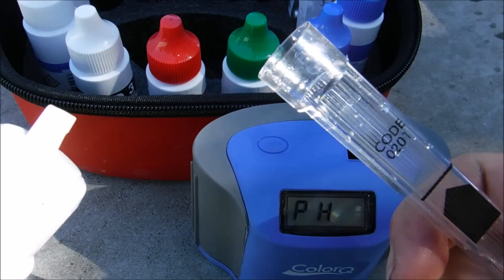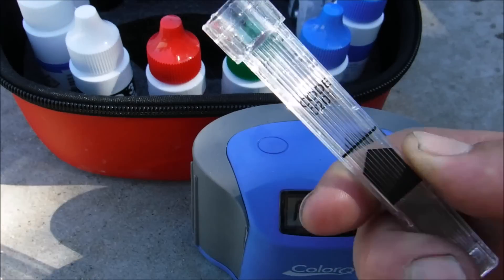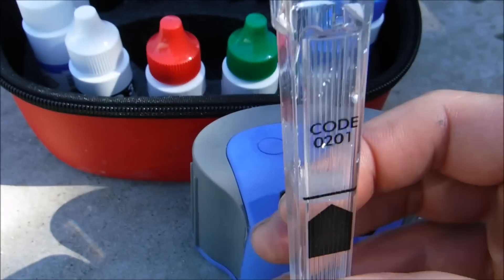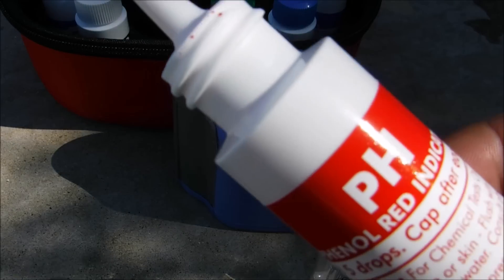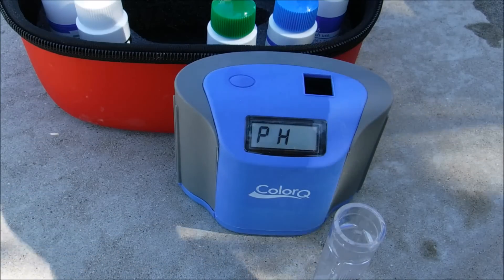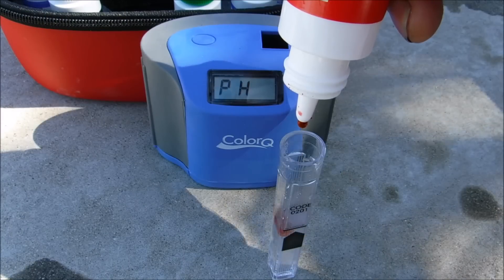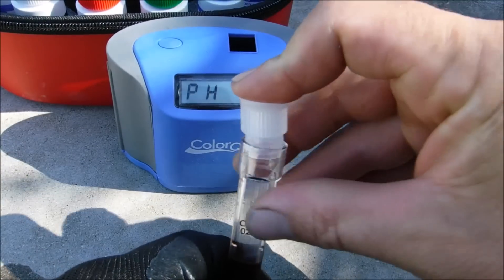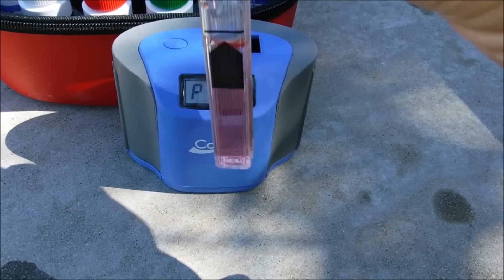The ColorQ Pro 7 is very easy to use. You just get a pool water sample and fill up this tube to the black line, which is the 5ml line. Once you have the sample prepared, add the reagent for whatever you're testing — this here is the pH reagent. You would simply put 5 drops into the tube, then place the cap on and mix up the sample.